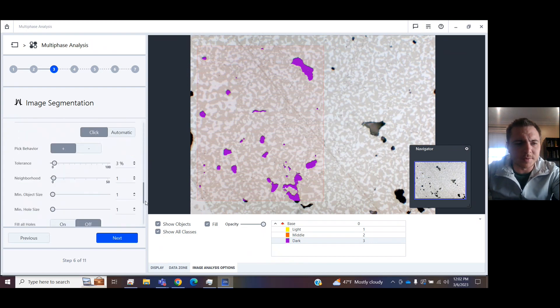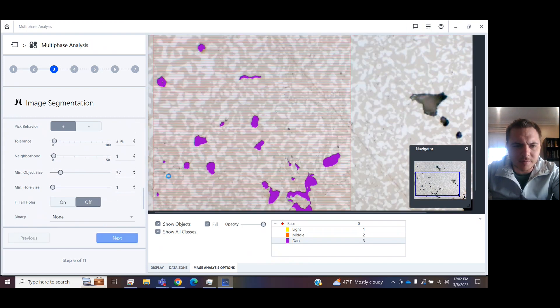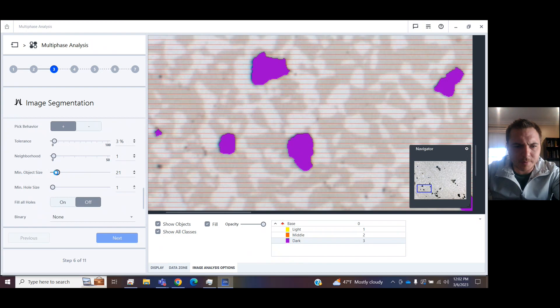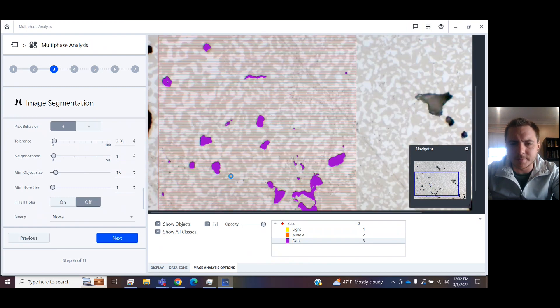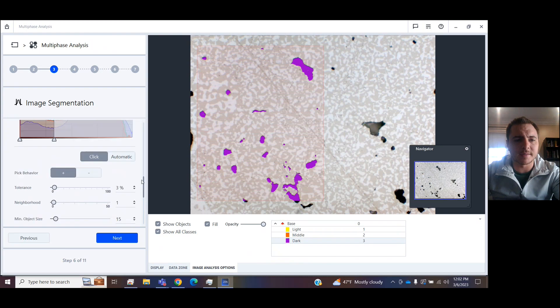I've also got some sliders down here so I can increase the minimum object size. We don't want to count some of this. So watch what happens as I decrease it, we pick those things up. As I increase it, we remove them. Let's say I want to set it to 15 pixels. Now I'm going to move to the other classes.